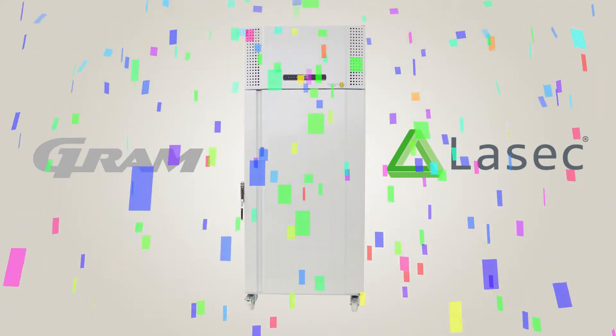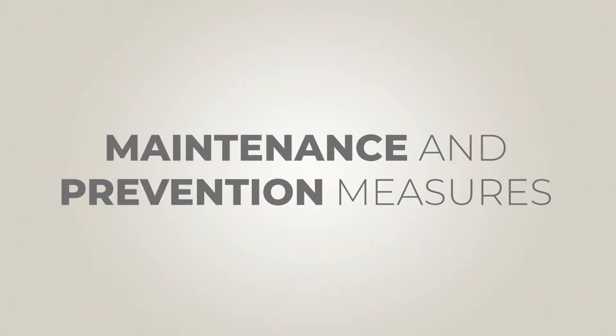Congratulations on purchasing your Gram BioLine cold storage cabinet. Maintenance and prevention measures are essential to the longevity of your unit. Please ensure the following when installing your Gram refrigerator or freezer.